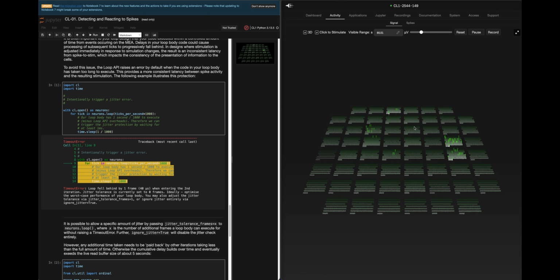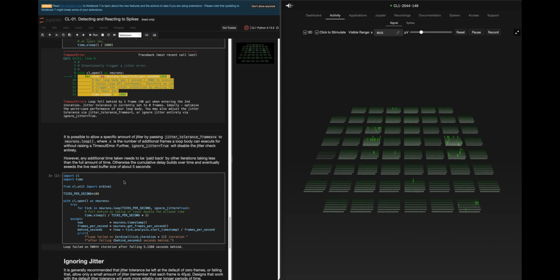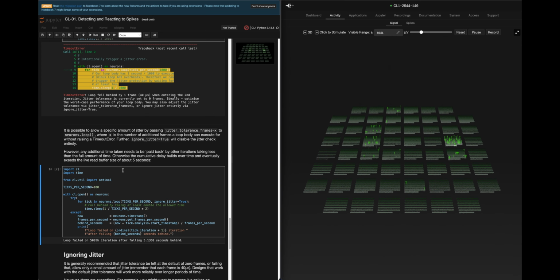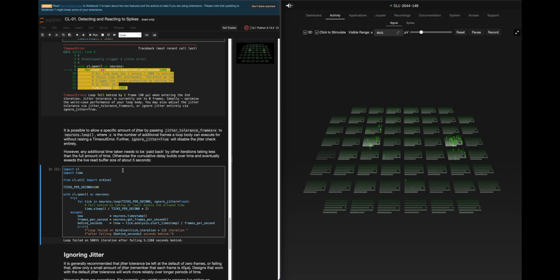Cortical Labs has thought this through very well in including these features for timekeeping, because I can say from my use of the machine, if you can't keep time, you're not going to be able to get good data, and data is everything here. The biology behaves in very different ways than other forms of compute. So it's really important to be one step ahead everywhere that we can be.